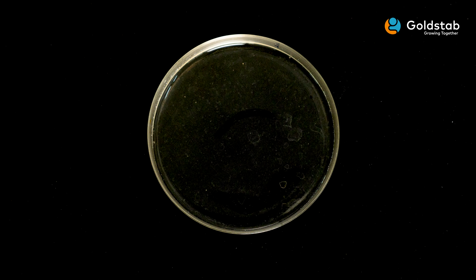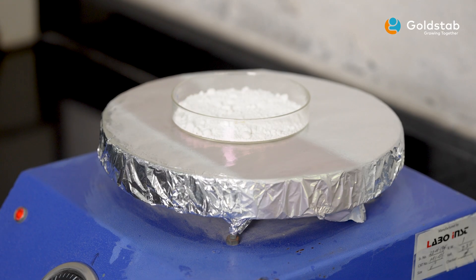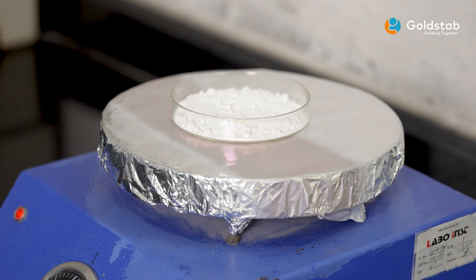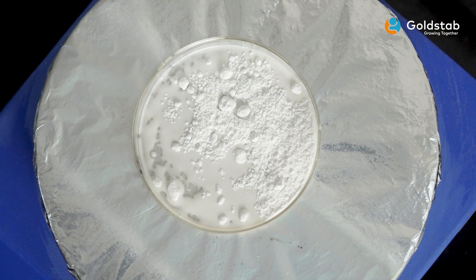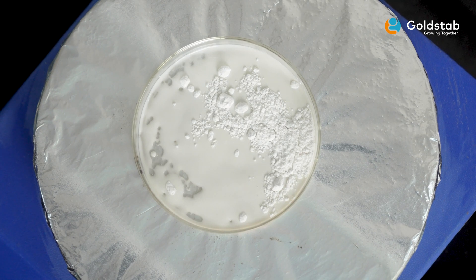Now observe the melt of another zinc stearate sample — the procedure followed is the same. Observe that the melt is hazy and viscous. This shows that the performance of this product will be lower and not comparable with the earlier sample.